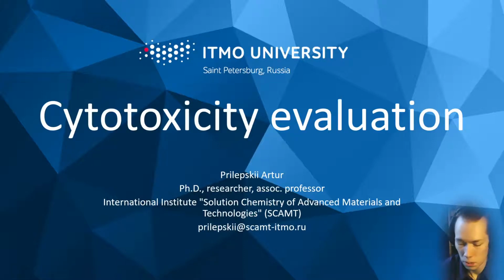Good day, dear students. I hope today's lecture will be much more clear in terms of sound, but still some noises will happen. Today will be quite a long lecture because we finally will be talking about how to assess cytotoxicity. Not even after incubation of your cells with nanoparticles, but just some general approaches to assessing cytotoxicity.